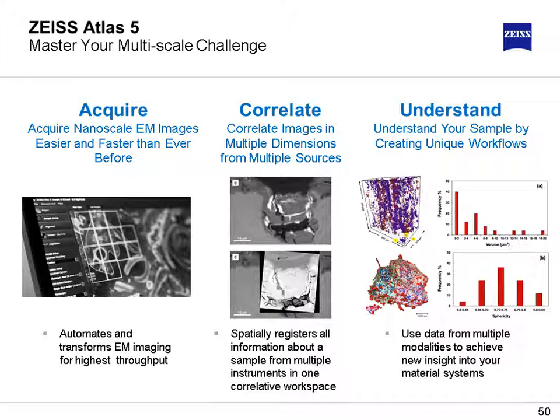And Atlas V is one approach that we've seen with quite a bit of success in the past year or so in combining data sets, both spatially but also dictating and driving decisions about navigation tasks. Of course, it does a number of advanced acquisition tasks on the electron microscopy and focused ion beam platforms. But it then allows you also to overlay images, but also spatially register them. So you effectively have a record of the context as kind of a sample-centric workflow where, as you acquire new information from the sample, it continually populates that model.